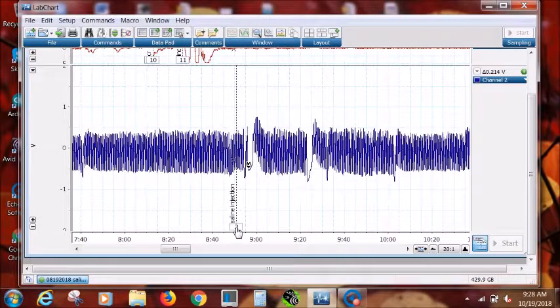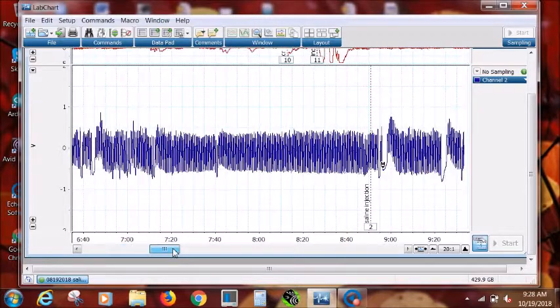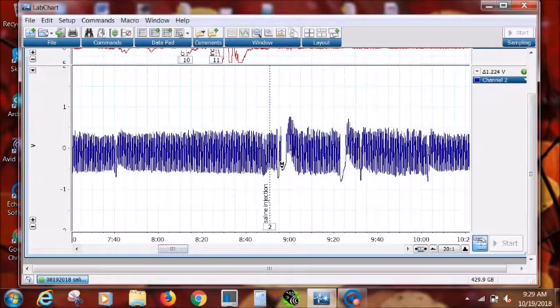I don't know if your software will allow you to make comments directly on the file, but what you would want to do is make manual comments on pieces of paper or open up an Excel file and do it that way. So what we're going to do here is zoom in on the saline injection. It's best when you're analyzing heart rates to analyze a few minutes before and then a few minutes after the injection. And what we also want to do, which I'll discuss later, is look for pauses. I'll zoom in on that later.